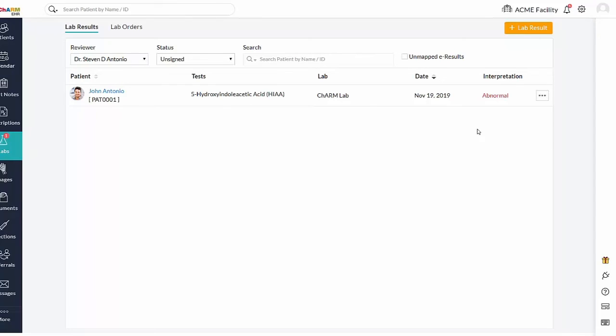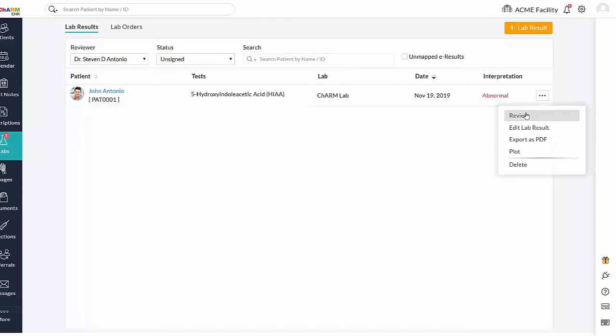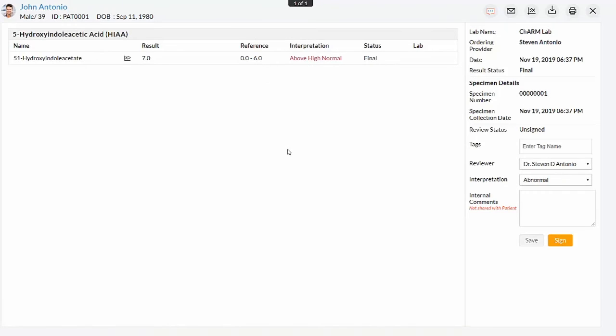Received lab results are in unsigned status and reviewer can review the results using review action item. Result details received from lab will be displayed in the review section. After review, result can be signed in this section.